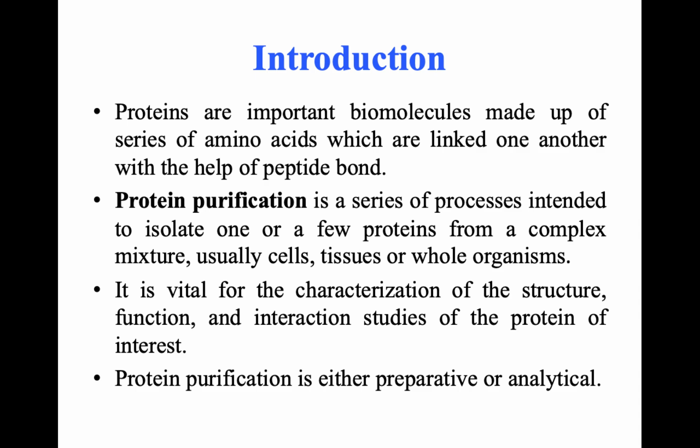Why is it important? It is important for the characterization of structure, function, and interaction studies of a protein of our interest. At the same time, protein purification might be preparative or analytical. Preparative means we are going to isolate the proteins at a mass level, but analytical means we are going to use it for research purposes.